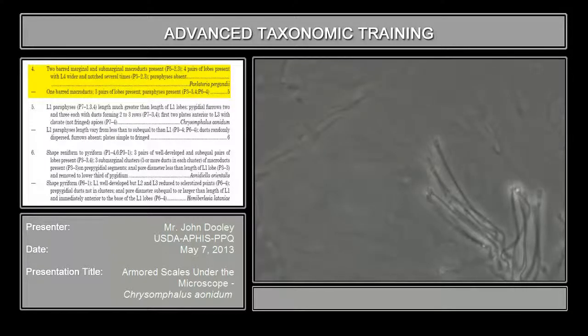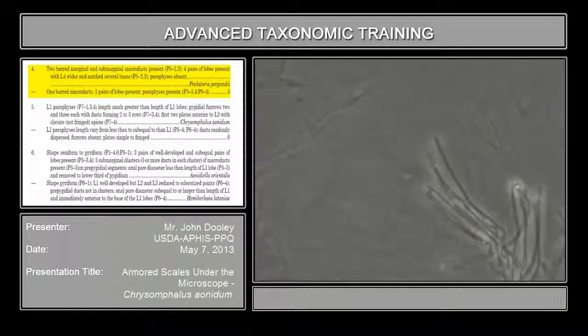But they're extremely long and very, very small. This is a one-bar, unless it's really obvious, like on your pygidium macroducts on the margin, where they're very, very thick, very large, and that you have to take more care.